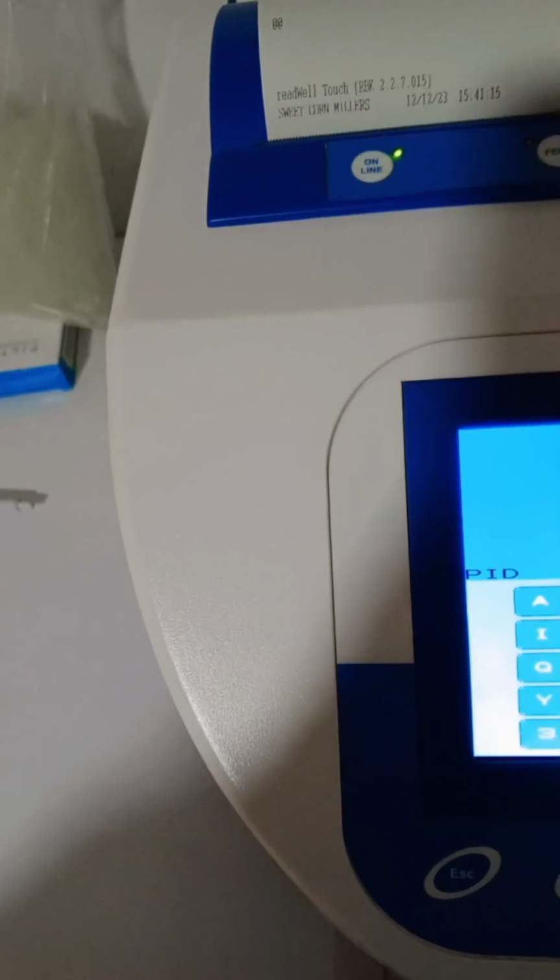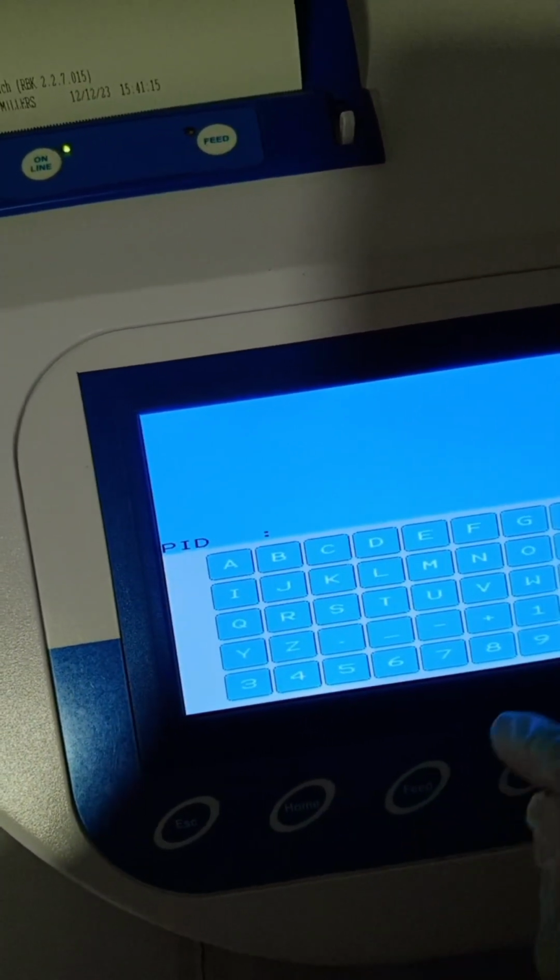So it's you to say sample A, the first sample is for customer A or X, and then the other one it's for customer Y. X and Y customers. So you have to know. Those are the codings I was doing because I knew how to. We have a way of how we label our samples. That's what I was doing.